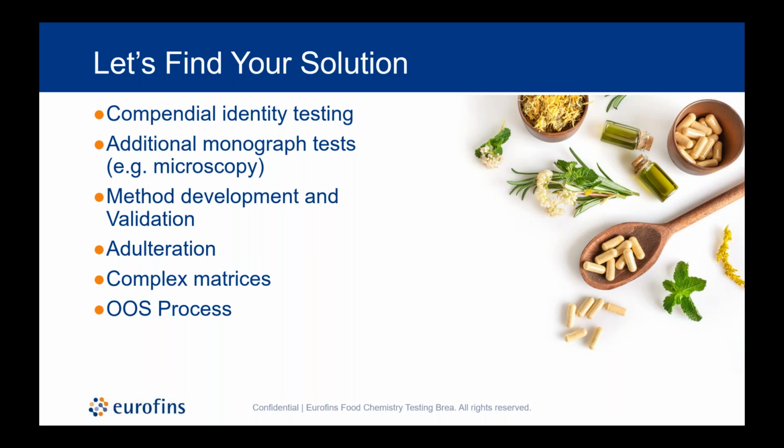In terms of the extract processing, that type of information, we can attempt to do an ID on just the genus, species, and plant part using the most fitting method for that information. And again, being transparent about possibilities that could result in a non-conform, because that material is not actually fit for that method, or because it's been altered and processed in such a way that we would need to do some more digging and potential method development to really find the appropriate test method.